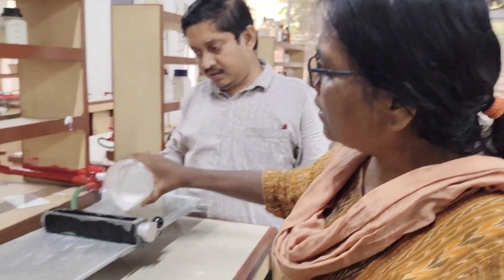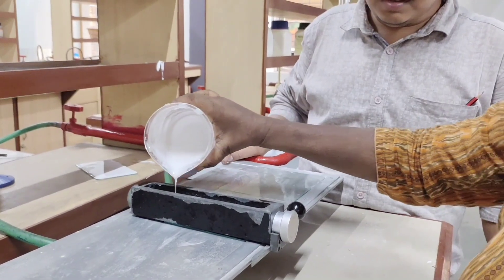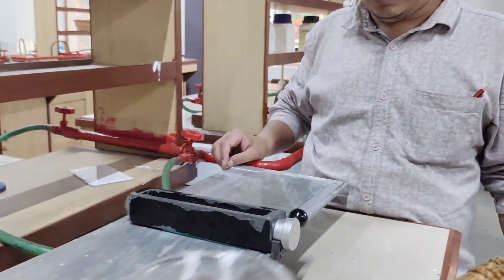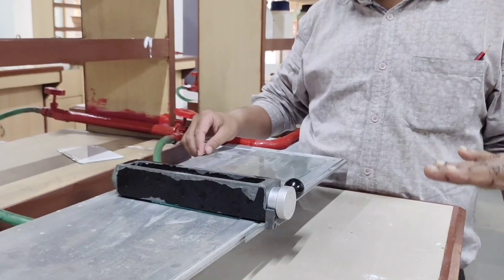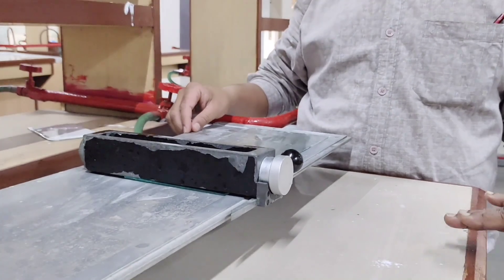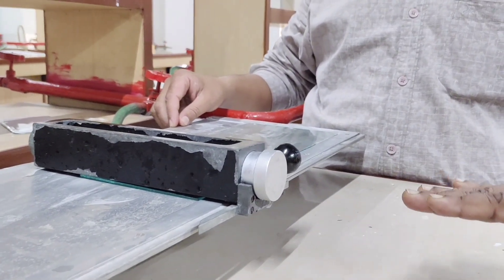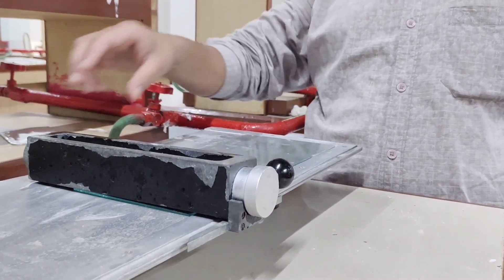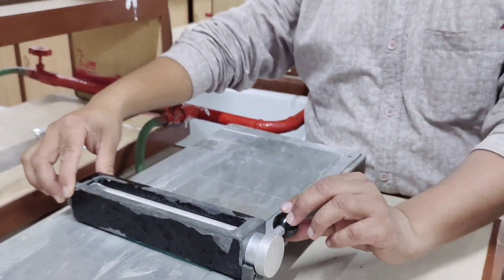Now that slurry is poured over the spreader — very slowly. Now Sari is going to draw it, because the drawing is very important. It should create a layer that is uniform. You have to apply the force very uniformly so that a thin layer of uniform thinness is created over the glass plate.